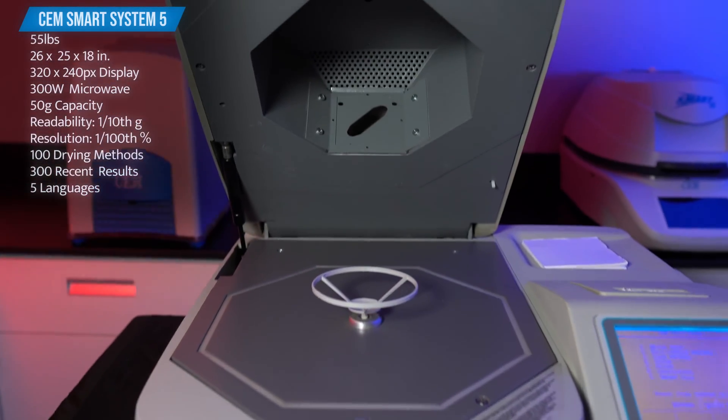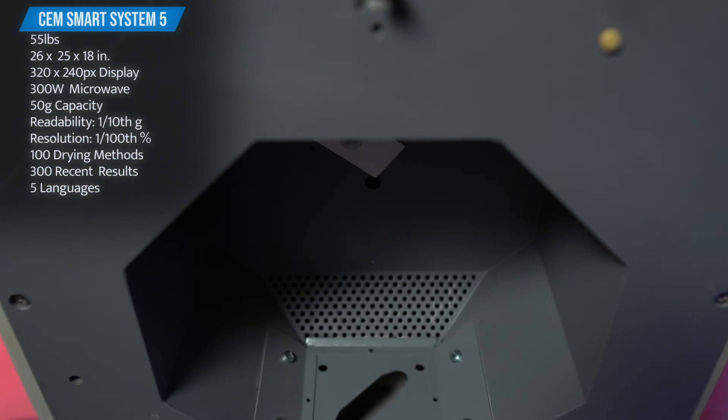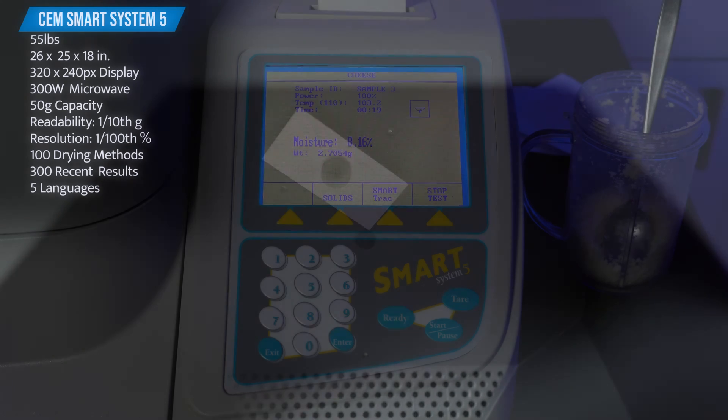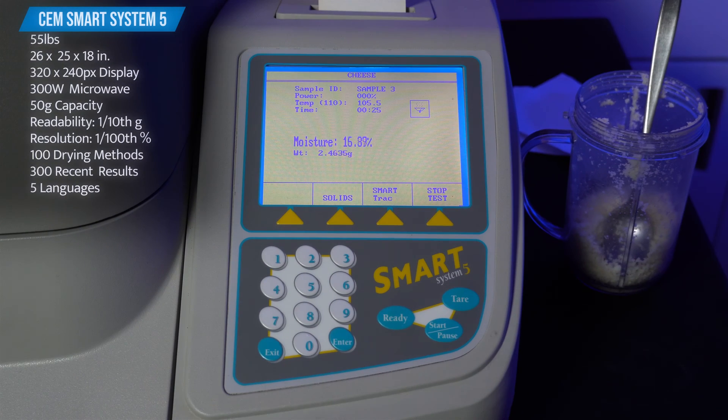The Smart 5 is heated by a 300 watt microwave, but will range between 150 to 300 watts when being used at 100% power. This is due to the infrared temperature controller that automatically adjusts the power while a test is running if it detects the sample is getting too hot. There's also a flame detector within the infrared controller that will shut off the microwave power when detected.